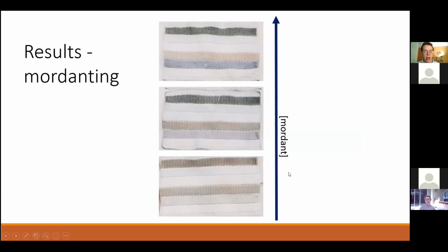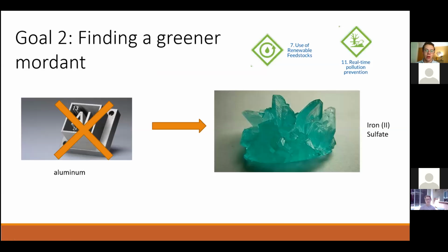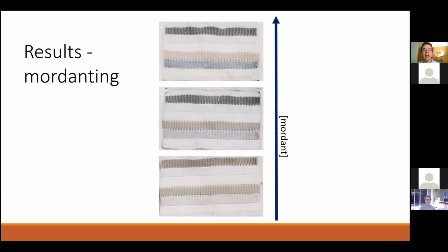What was interesting for me was that I thought perhaps that the mordant might convince, all of these are dyed with red cabbage, by the way, so I thought that red cabbage might be having like that the chromophore might have more of an affinity for these ones that aren't dyed, if they were first treated by a mordant, and this obviously shows that that's not the case.